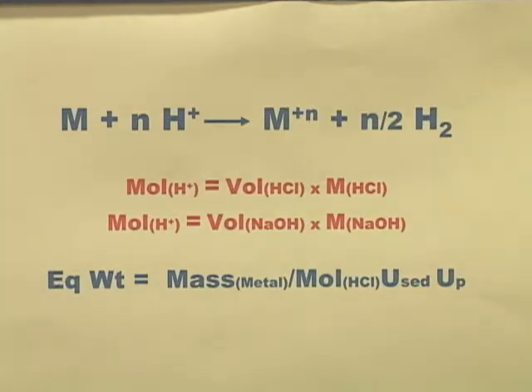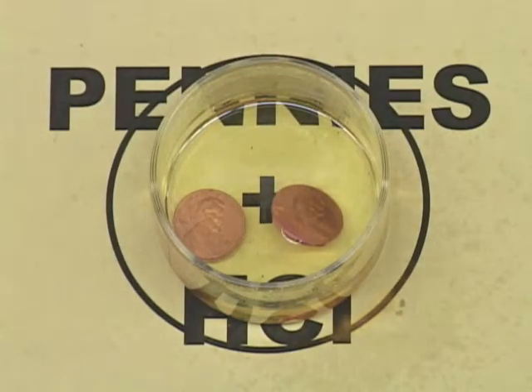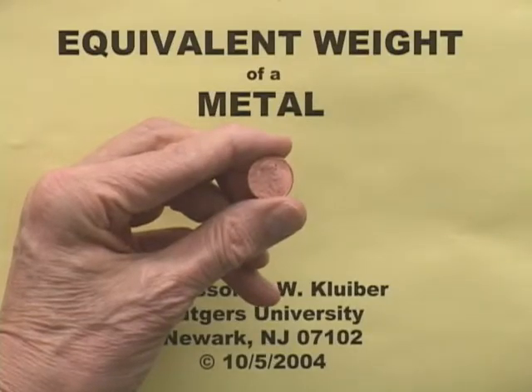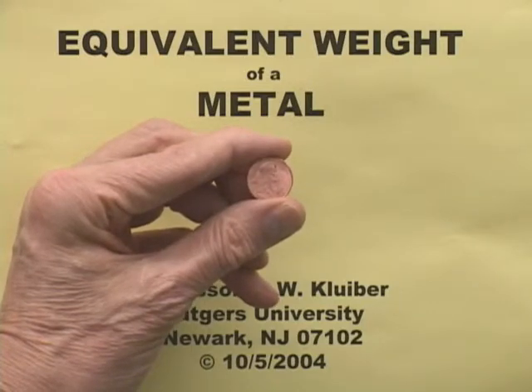Well, I think you should be able to do this, but there's one last thought that I have here. Remember that penny that we had in HCl that was giving off all that bubbling? Treating modern pennies with hydrochloric acid gives a whole new meaning to pinching pennies.